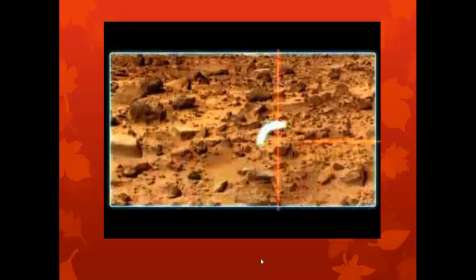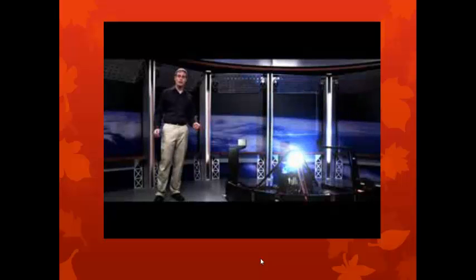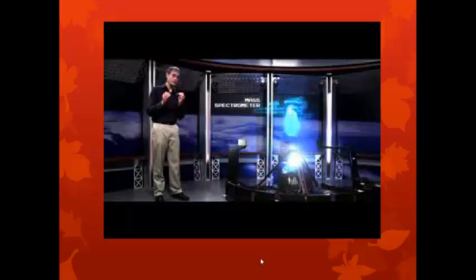Obviously you can't tell just by looking at pictures of Mars, but scientists think the answer may lie hidden in tiny molecules in Martian soil. So how do you take apart a molecule to see what's inside? Luckily, scientists have a tool to do just that. It's called a mass spectrometer, and it lets us take an extremely close look at whatever we're studying.